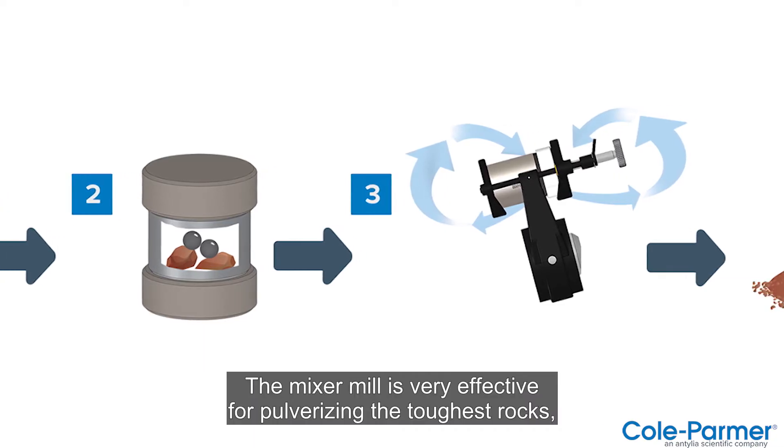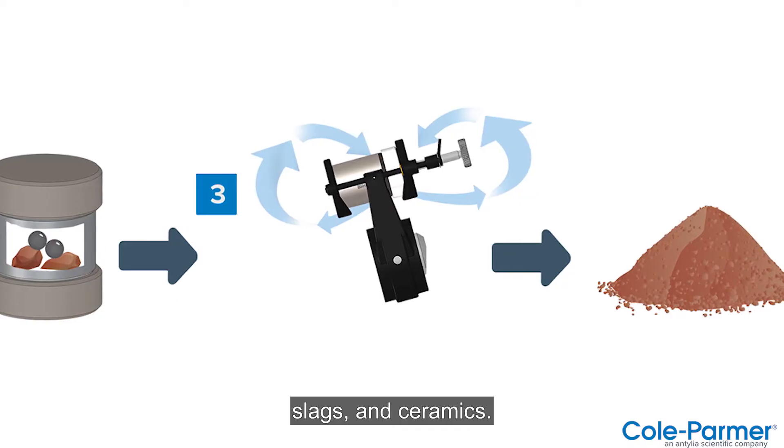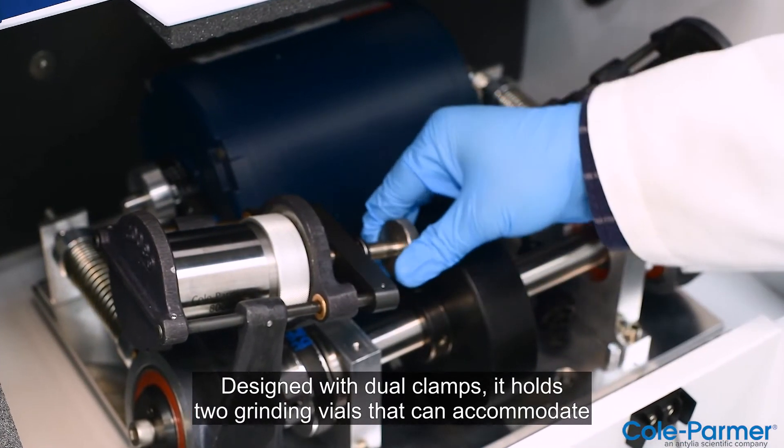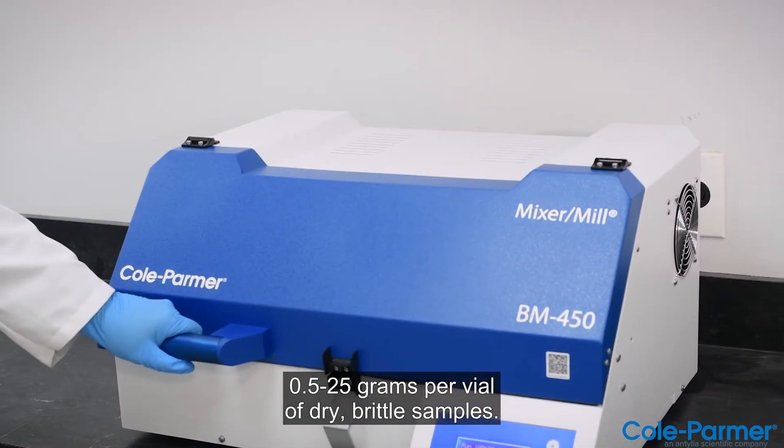The Mixer Mill is very effective for pulverizing the toughest rocks, slags, and ceramics. Designed with dual clamps, it holds two grinding vials that can accommodate 0.5 to 25 grams per vial of dry, brittle samples.